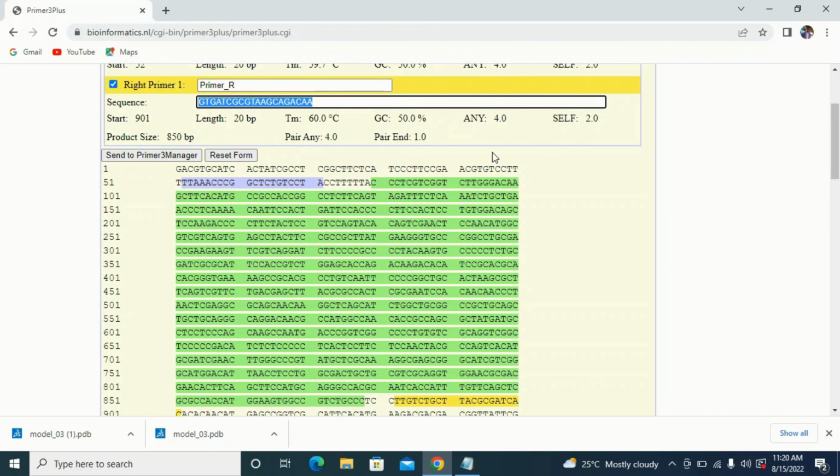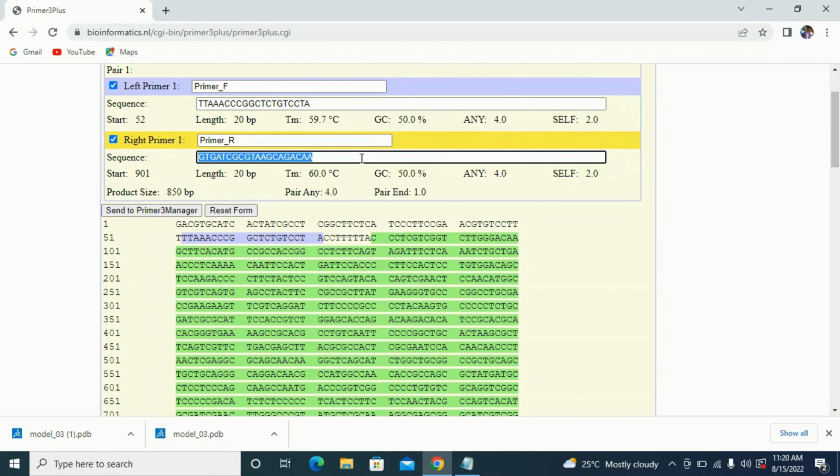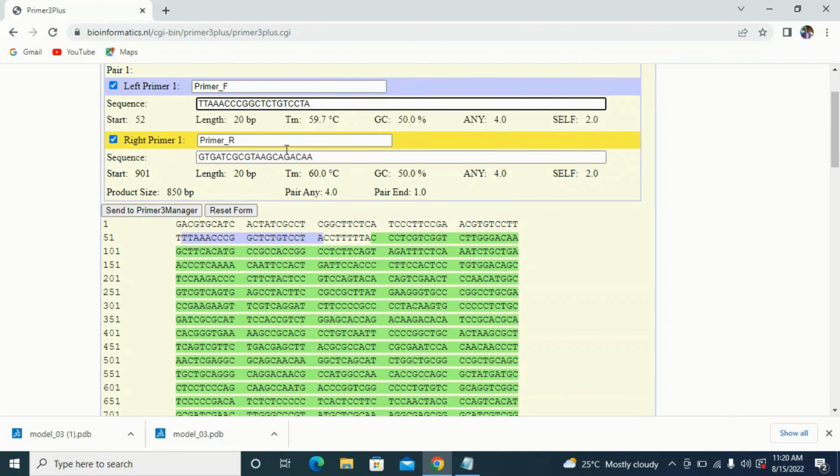So with this, you have picked your primer, and you can simply inform those in the lab using the PCR to make use of this while doing the PCR of your gene or your particular FASTA sequence. This is how we pick our primer, and make sure you consider these factors, because you will surely report them while making your write-up on your primer designing.